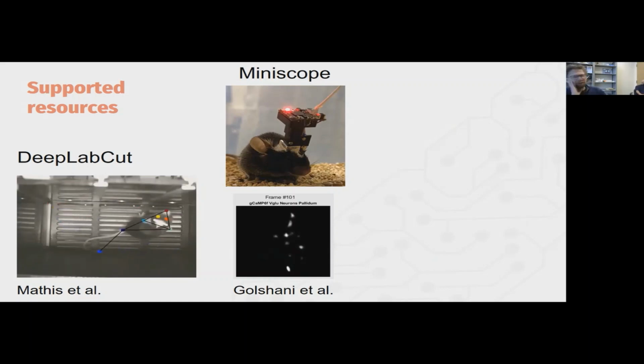I'm looking off screen for neurons. Yeah, I mean, it's a good question, Mike. You could see hundreds of neurons. There are different, there's Miniscope imaging. You know, there's also mesoscope imaging, which of course is different from Miniscopes, and that's not implanted. I'm gonna say it's on the order of like a millimeter or so, millimeter diameter.